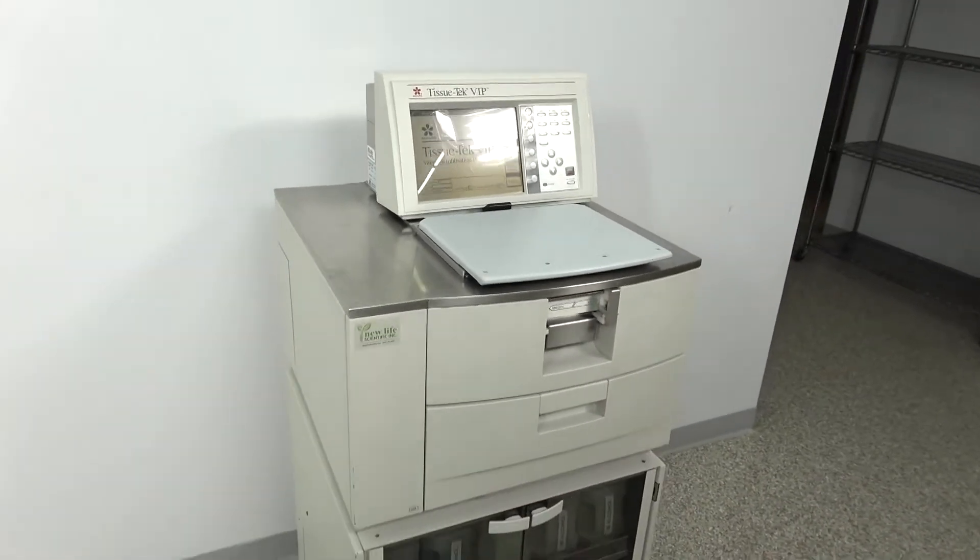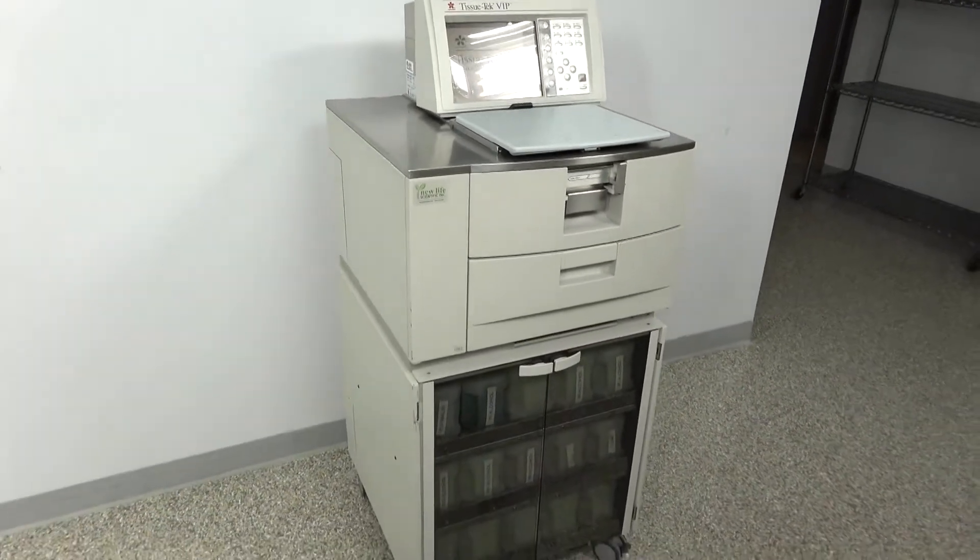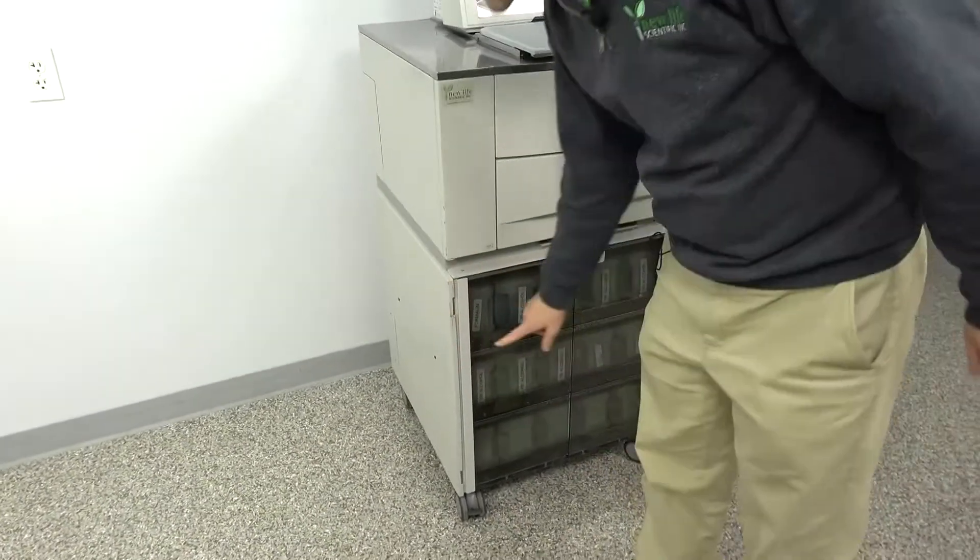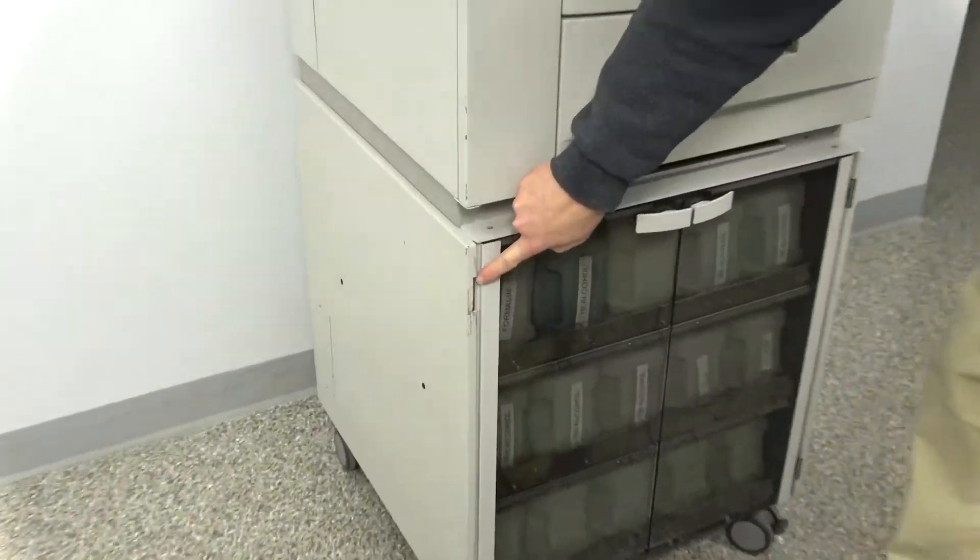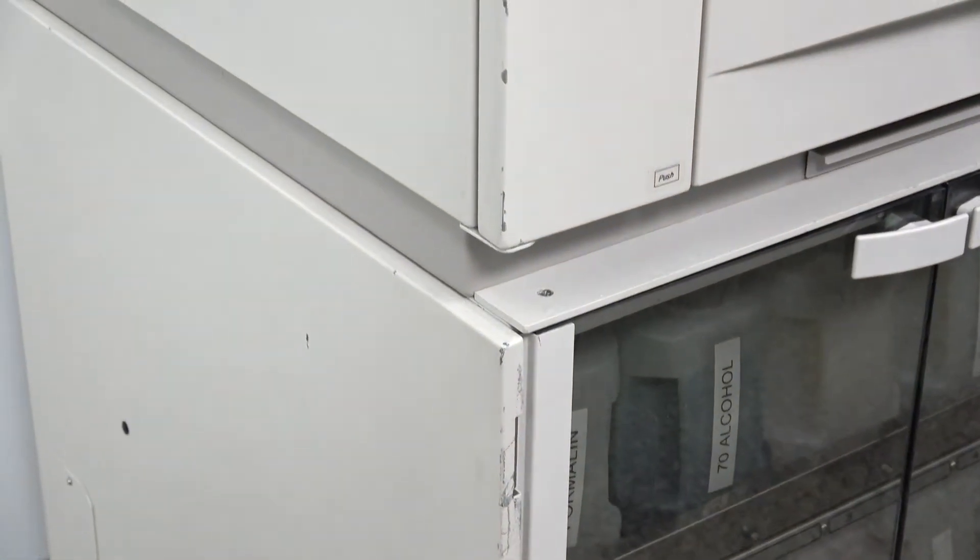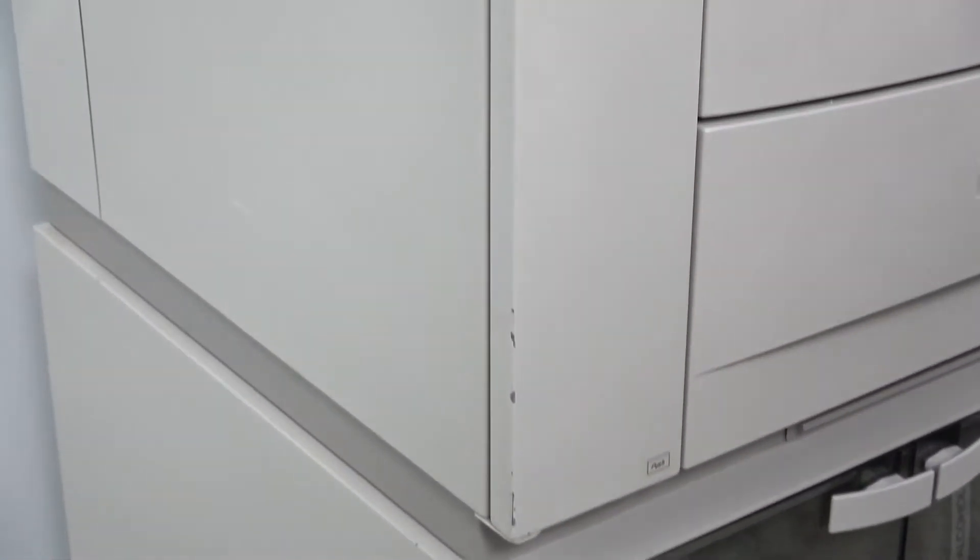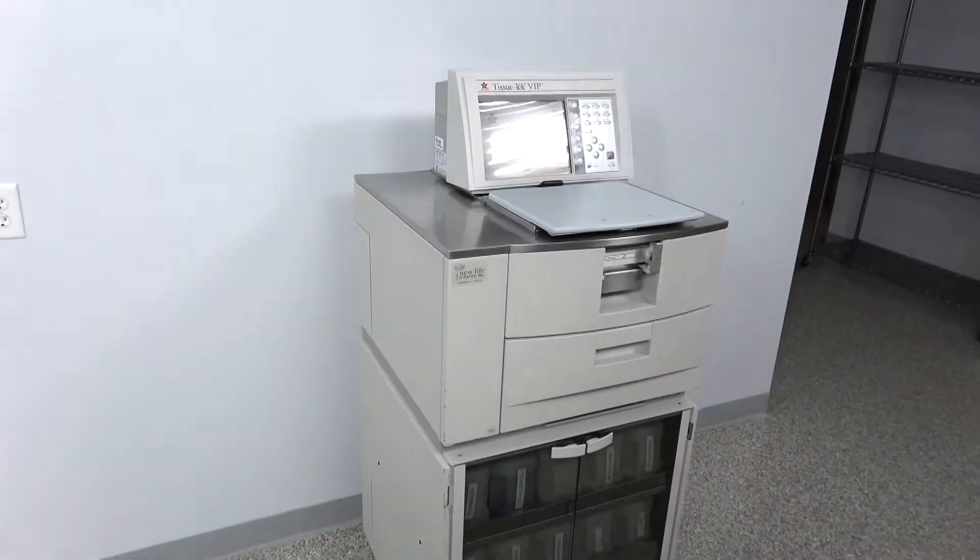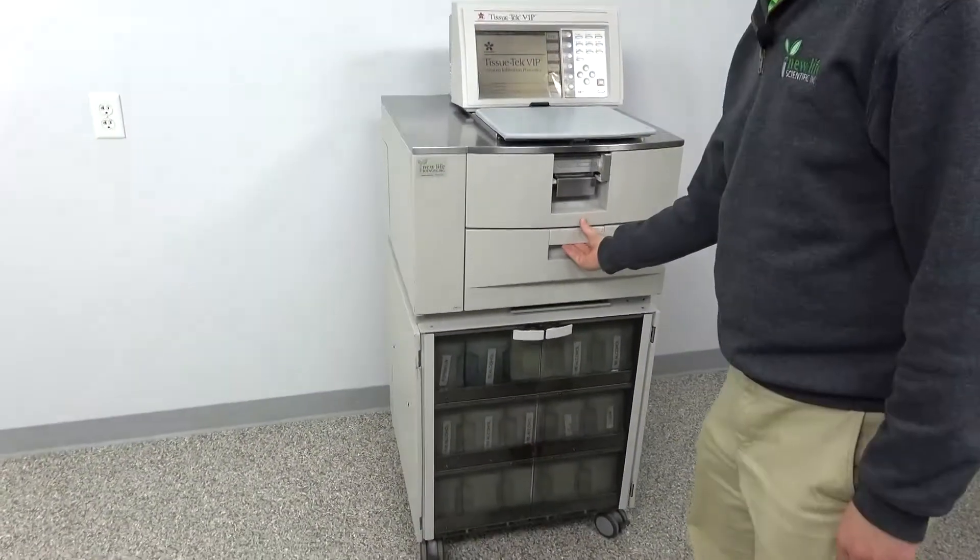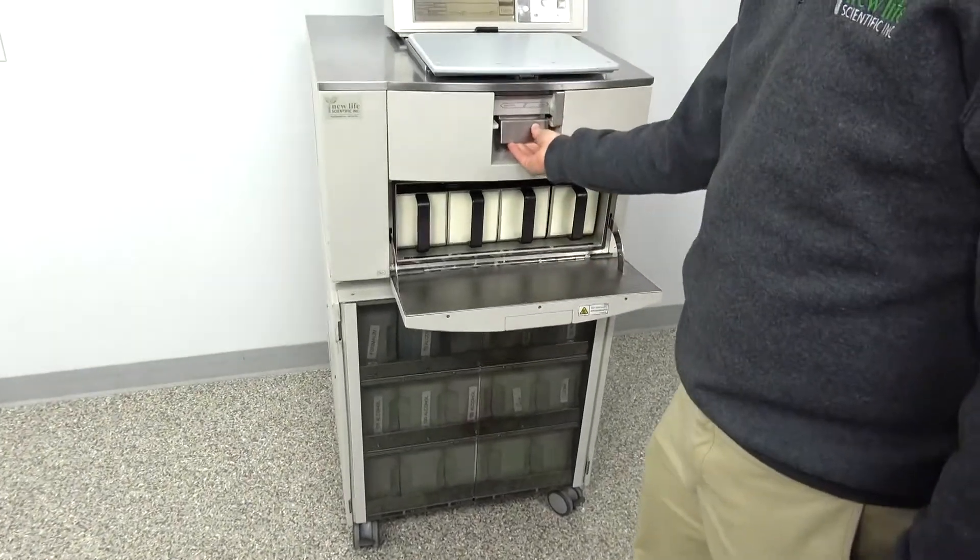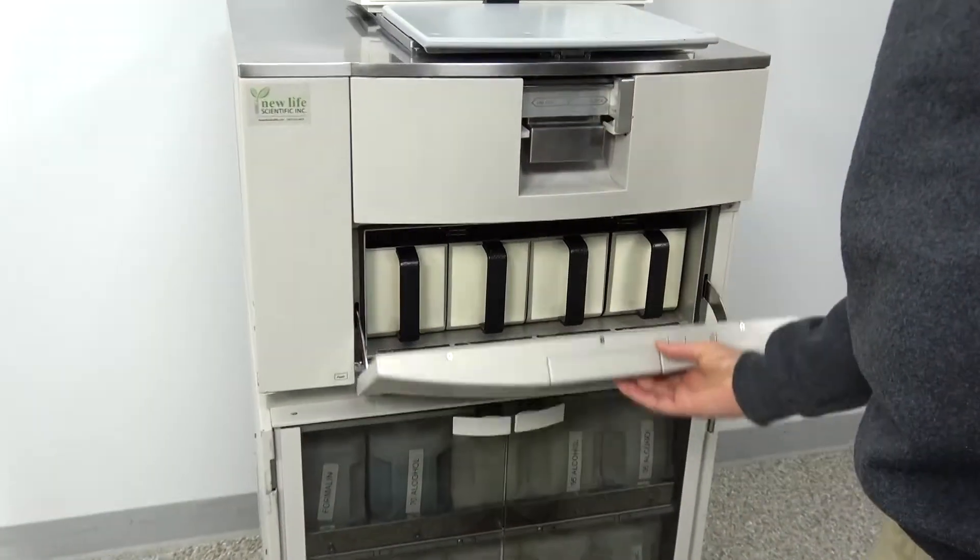This one is what I would call in good shape. The only reason I would say good and not excellent is you've got a few marks over here on the front and on the corner, but this is not an abused system. This should be a good, healthy looking VIP 5 for your laboratory. It's also looking good on the inside too, no sort of stupid abuse of any kind on the inside.